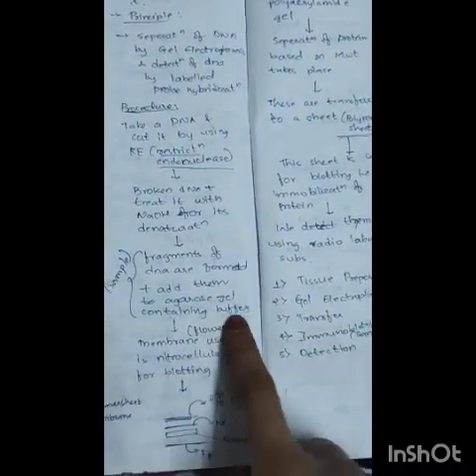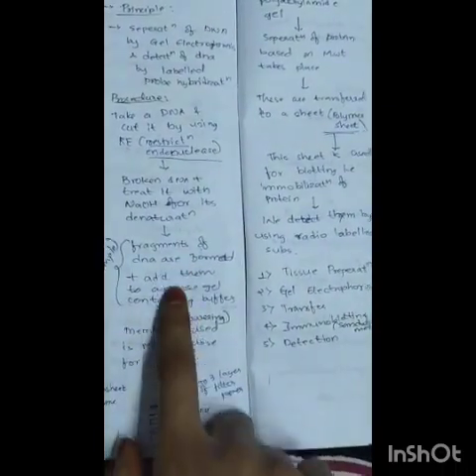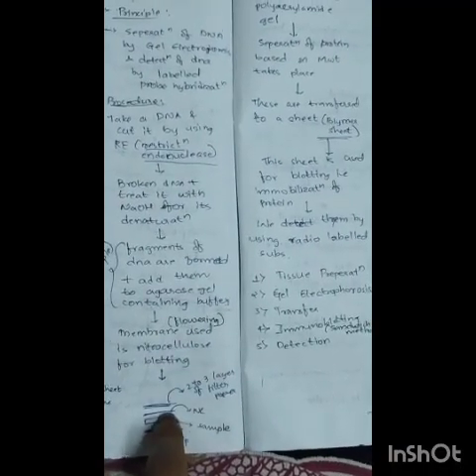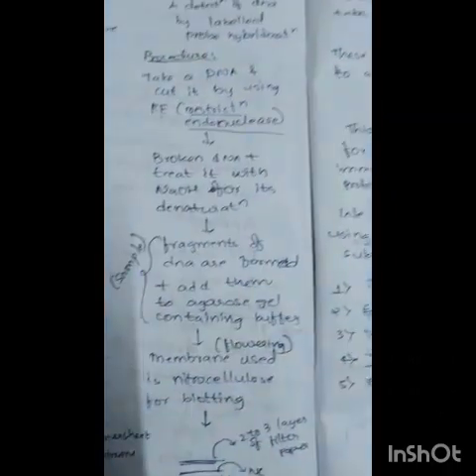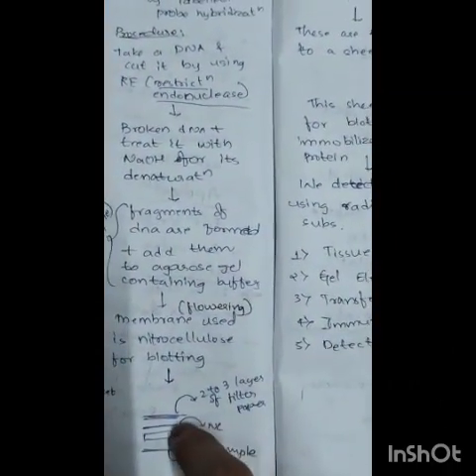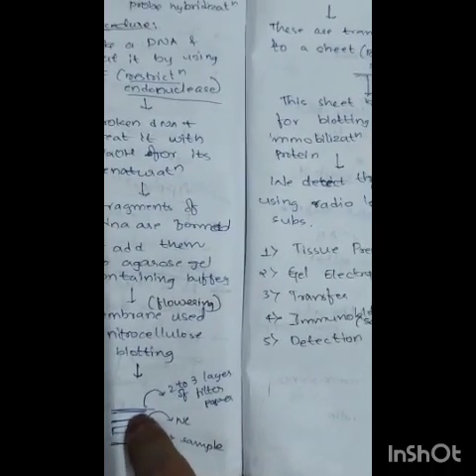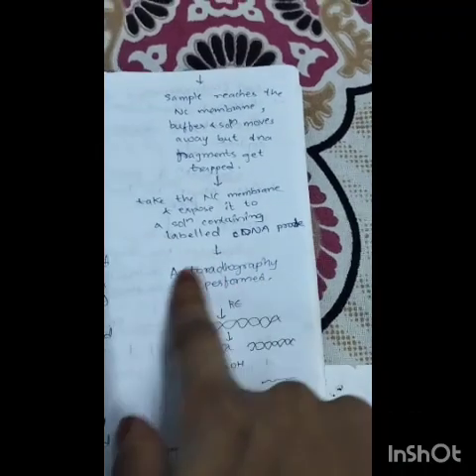The blotting technique is flowering. Firstly, filter paper is placed and then the sample is placed above it. Nitrocellulose is placed, and then 2 to 3 layers of filter paper are placed. After this preparation, the sample reaches the nitrocellulose membrane and goes up to the filter papers, but the fragments get trapped in the nitrocellulose membrane. Then this nitrocellulose membrane is exposed to a solution containing labeled cDNA probe. Then autoradiography is performed.